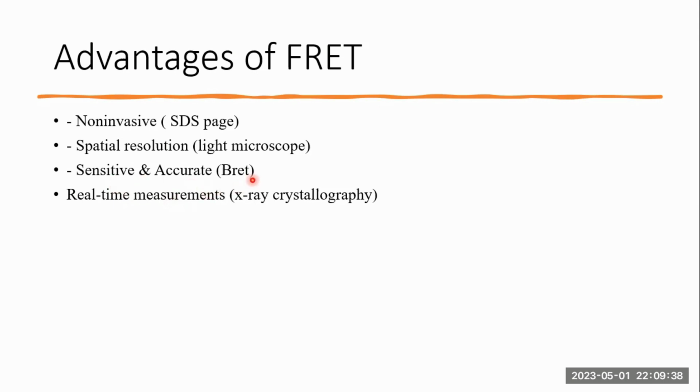Now, BRET is very similar to FRET, but it stands for bioluminescence resonance energy transfer. BRET is more useful when studying long-term. However, in the short term, there's more background noise in BRET, so there are more different signals emitted. So it's not as accurate as FRET, and FRET is more sensitive. So we can view it with much clearer, crisper pictures, tuning out the background noise.